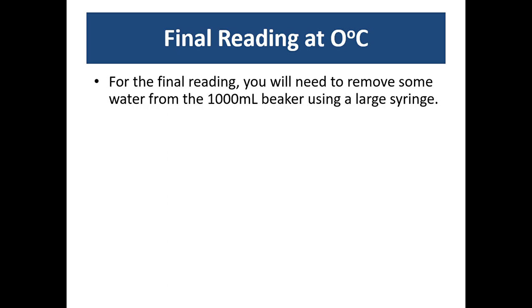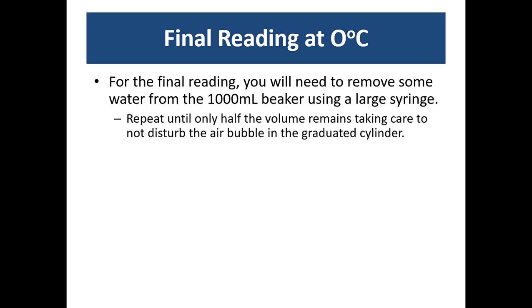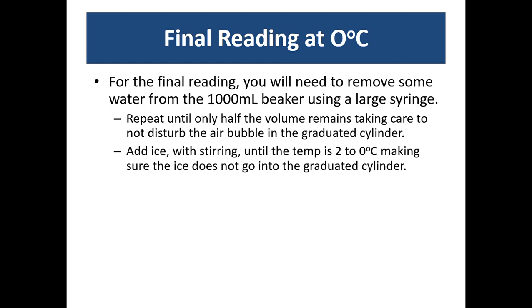For the final reading what you're going to do is take a reading of the volume of the air bubble at zero degrees Celsius. So you'll need to remove a lot of the water from the beaker. We'll use a large syringe with a rubber attachment to it. You may have to repeat several times until you have about half the volume of water left. Now make sure you don't disturb the air bubble in the graduate cylinder. Okay now very carefully with the stirrer on we're going to add ice until the temperature is about zero to two degrees Celsius. Make sure the ice doesn't go inside the graduate cylinder. Remember ice has a different specific heat than liquid water and you might affect the way heat is being transferred in the process.